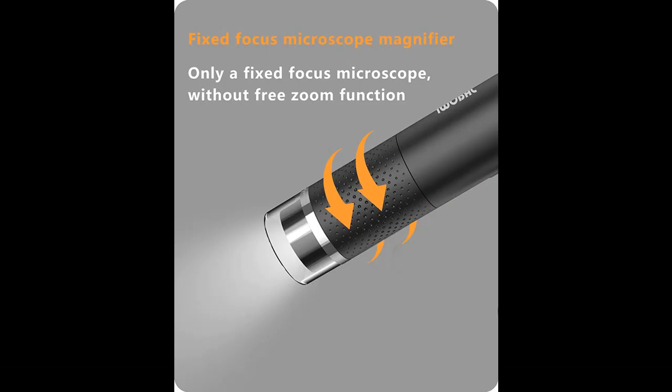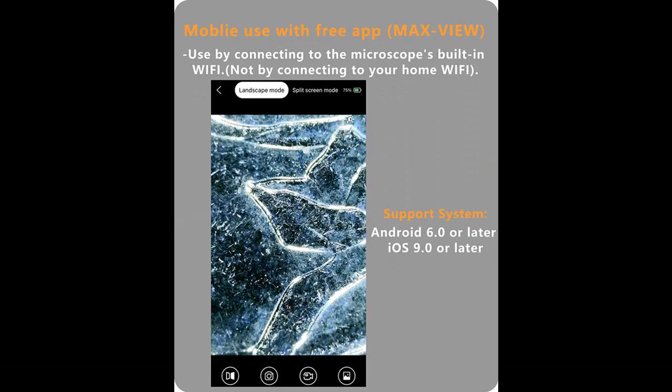This microscope is a very interesting tool for parents, adults, teachers, students, children, collectors, testers, electronics repair folks, and inquisitive folks who are interested in exploring the microscopic world.